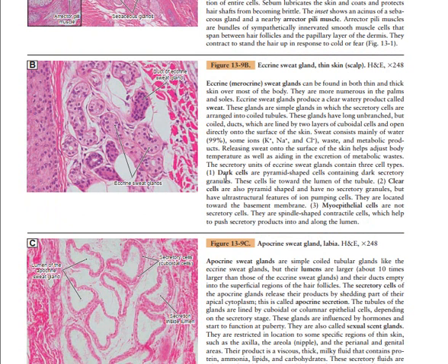It has a dark cell type, which are pyramidal shaped cells, and you also have a clear cell type, which are also pyramidal with no secretory granules. So these are the two main cell types. These are the dark cell type, and these are the clear cell type. The dark cell type has secretory granules inside, while the clear cell type does not have any secretory granules inside.